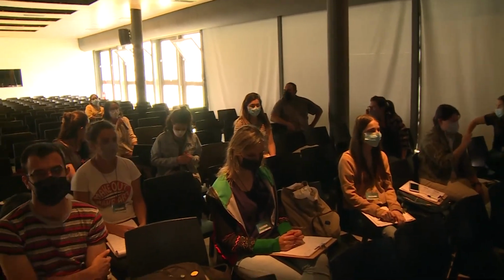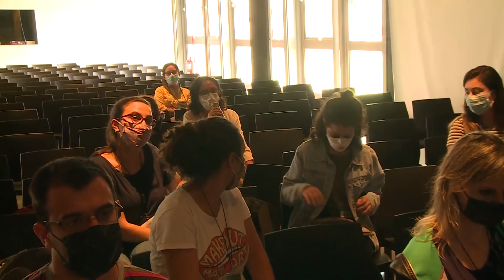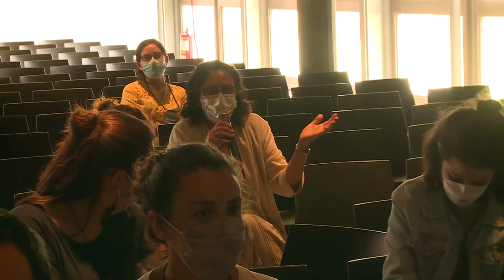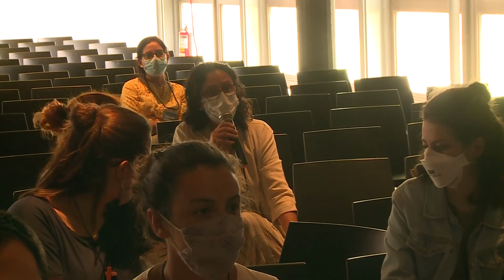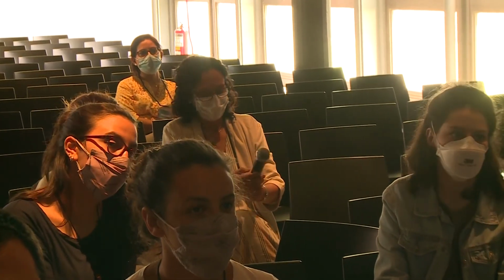Very interesting talk. I have a few questions about the sample preparation for the protein correlation using size exclusion. Did you have to take any special care to prepare samples and make these reproducible, to keep the different complexes bound? And another small question is regarding the type of interaction you are recovering in the classification you showed in the first slide.